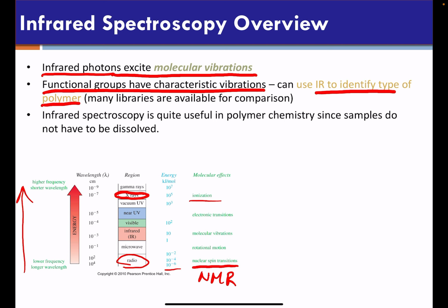And we're going to find here that the infrared spectroscopy technique lies about midway there, around 10 to the power 1, or 10 to the power 0 in energy on a kilojoules per mole of photons. Okay, putting that all into wavelength using E equals hc over lambda, we can determine here the wavelength.